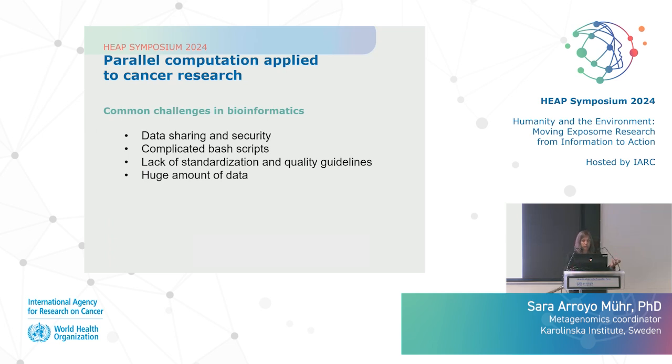While on the opposite, when you go to the laboratory, the protocols are straightforward, and you know it's 2 microliters you have to add. Then it's 2, it's not 3, not 1. But here in bioinformatics, it seems that we are playing with the cutoffs depending on the data set that we have. And as I said, we have huge amounts of data.